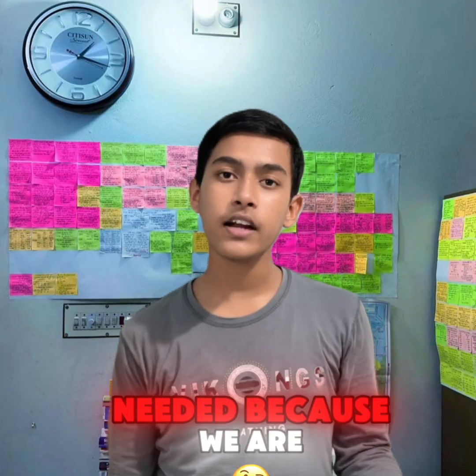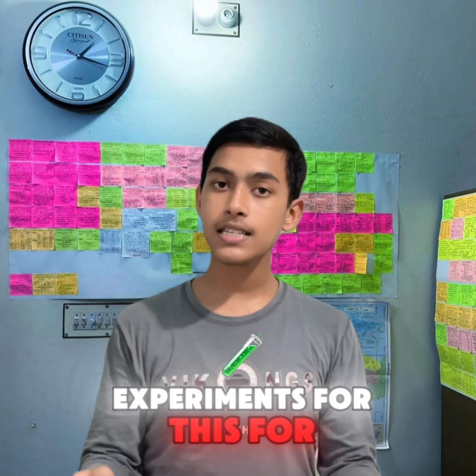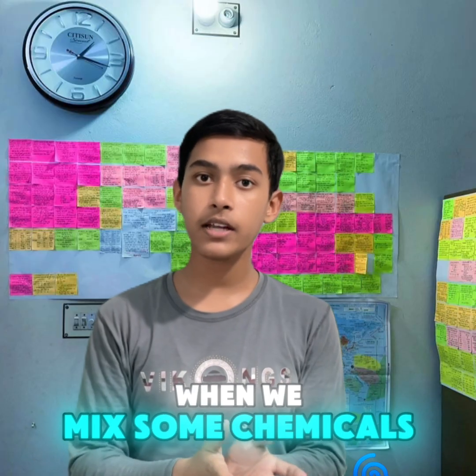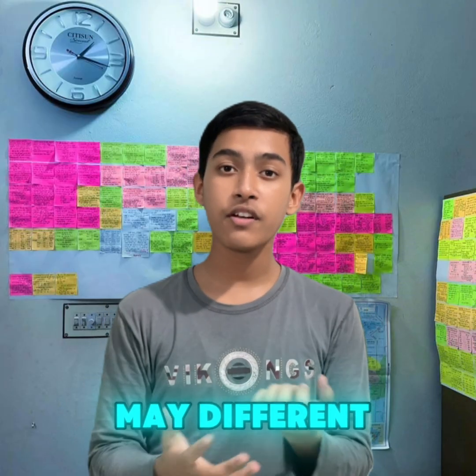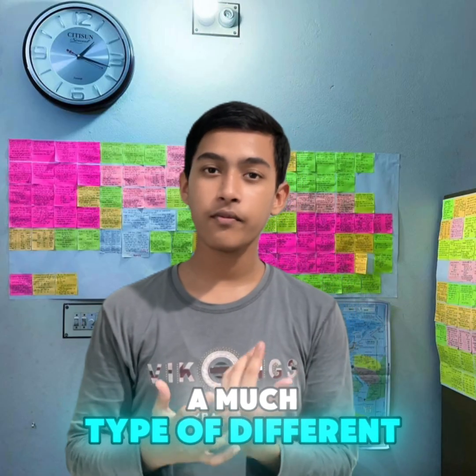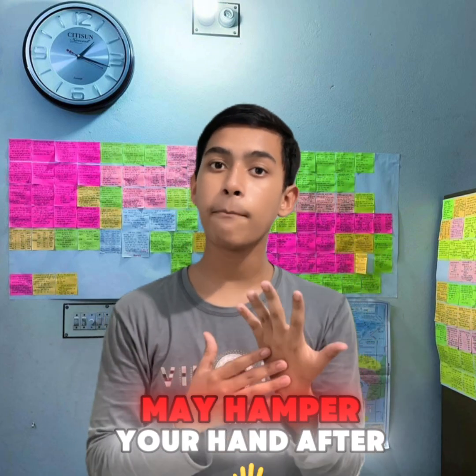Then the hand gloves. Hand gloves are needed because we do many experiments with our hands. When we mix some chemicals, some type of reaction may occur. If it harms our hand, we may not feel huge destruction immediately, but it may hamper your hand after 10 or 15 years.